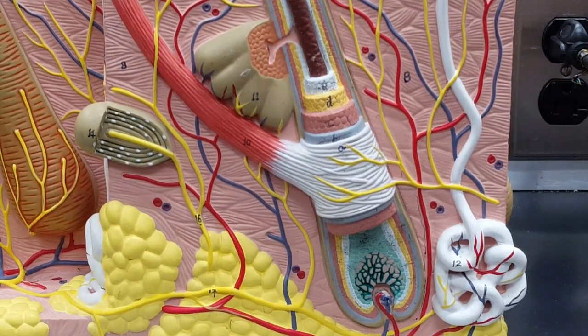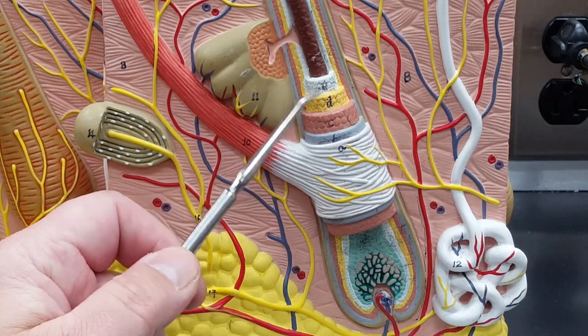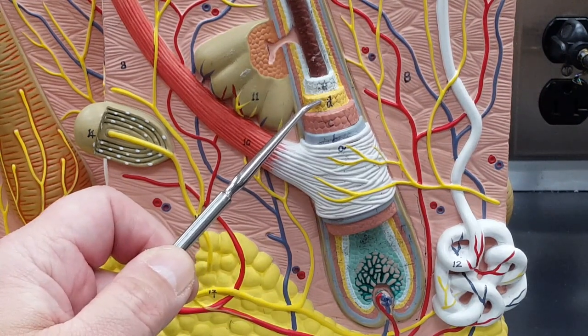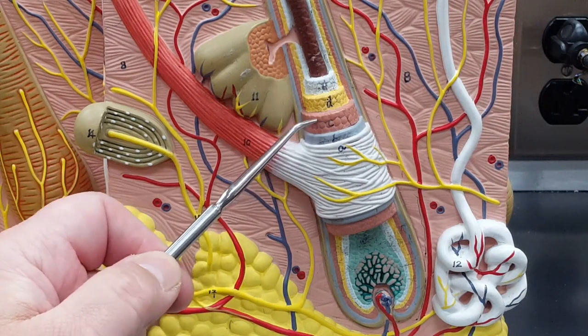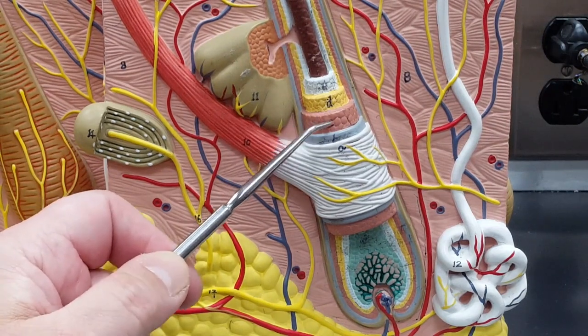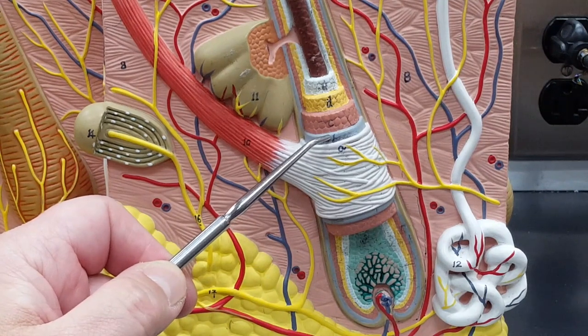This is the hair. But the hair has tissue layers surrounding it, namely three, an internal and external root sheath, and a dermal root sheath. I'll say that again. An internal and external root sheath, and a dermal root sheath. So again, this white is the cortex. Internal root sheath is yellow. External root sheath is, what would you call that? Sort of a pinkish, dull pink, rose color maybe, how's that? And then in gray, the dermal root sheath.